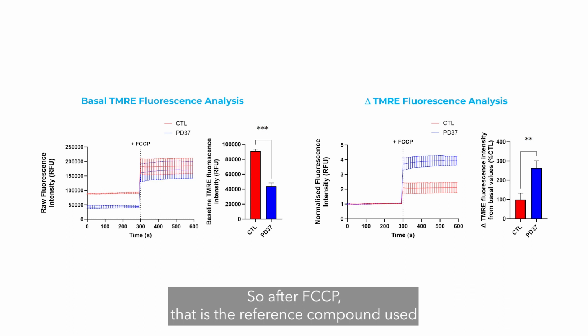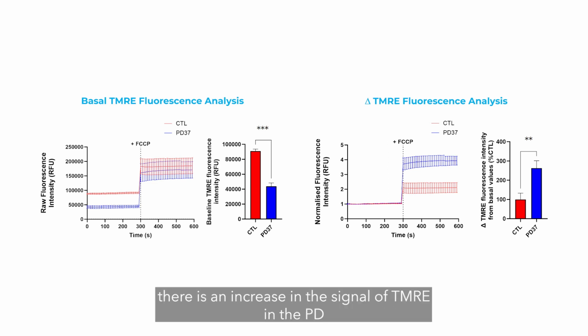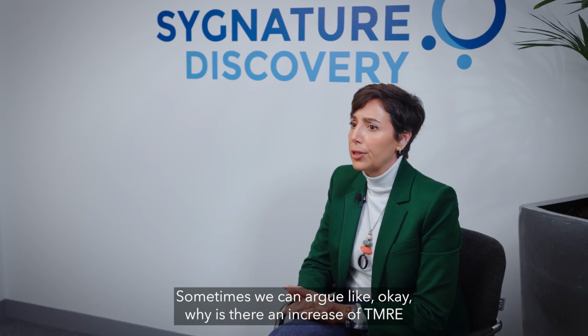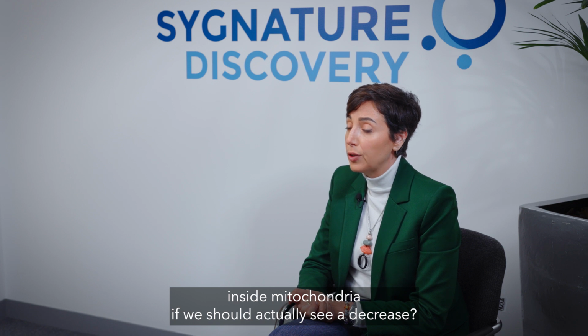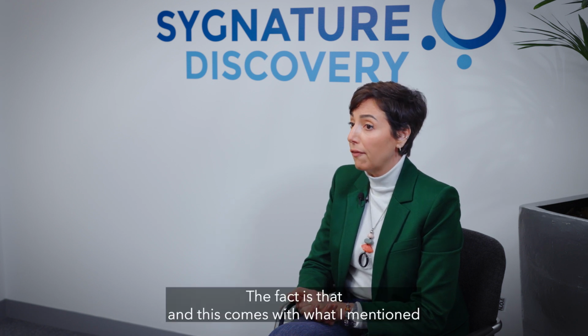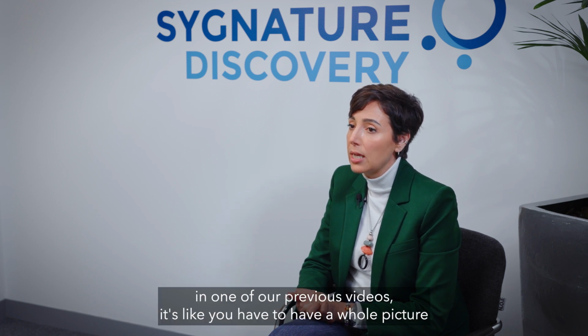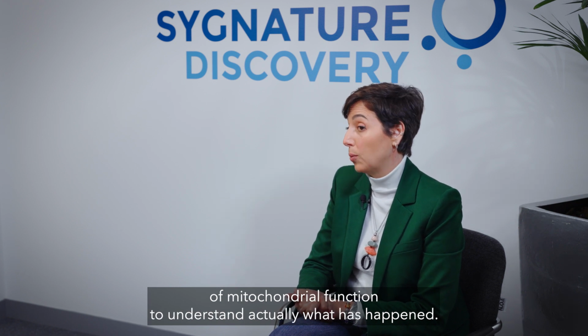So after FCCP, that is the reference compound used very often in these kinetic experiments, we can see that there is an increase in the signal of TMRE in the PD cells in comparison to the control ones. Sometimes we can argue, okay, why is there an increase of TMRE inside mitochondria if we should actually see a decrease? The fact is that, and this comes with what I mentioned in one of our previous videos, you have to have a whole picture of mitochondrial function to understand what is actually happening.